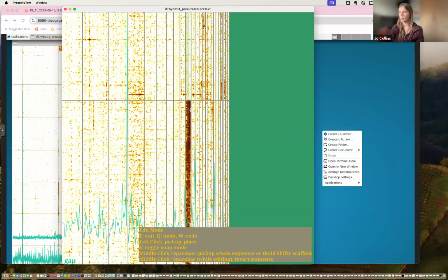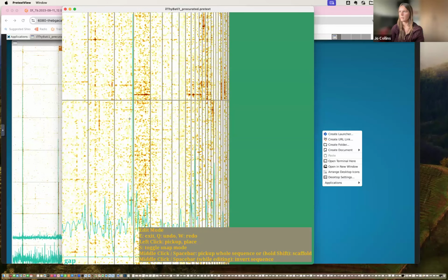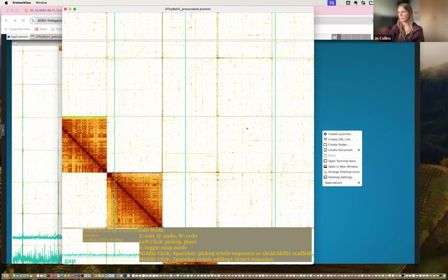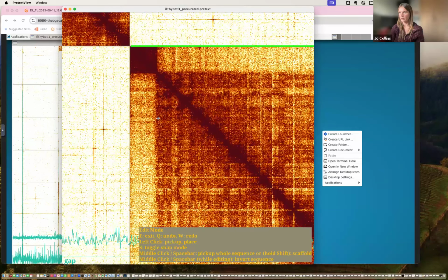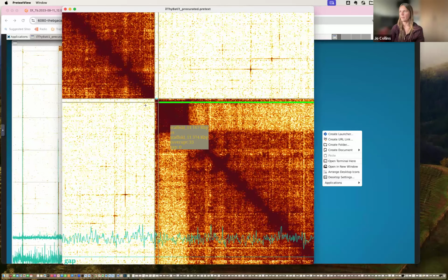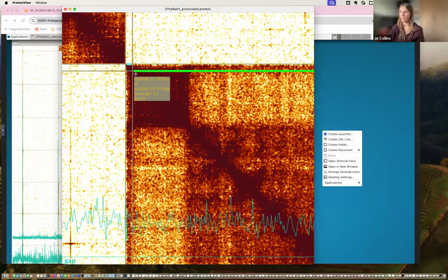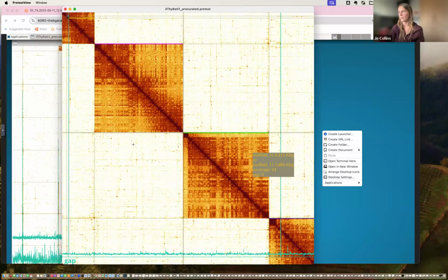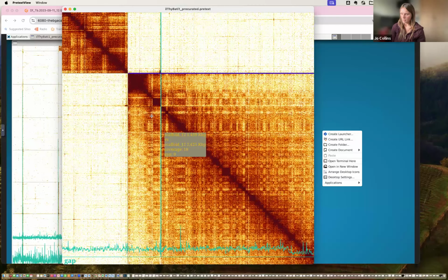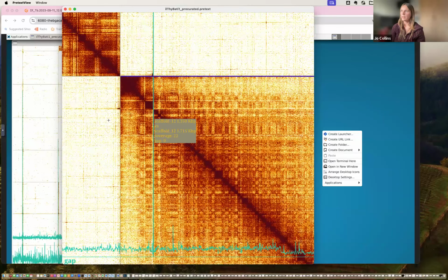Again, we've got a small piece, so press E, middle click, scroll out, drag the piece across, making sure snap mode is on, left click to drop the piece. The contact tells us where to place the piece. We've got really strong contact between the left end and the right end of the small piece of shrapnel. So it's great. Right. So now I'm just going to take my gaps off for a second.